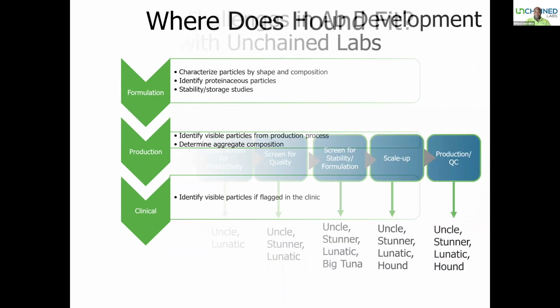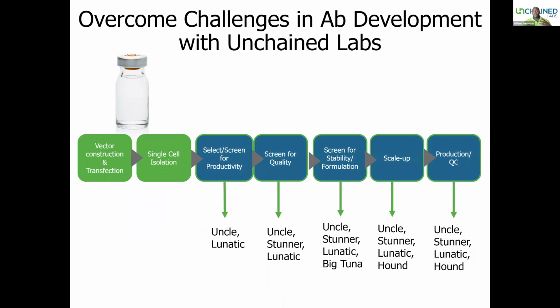So if we now think about what we just went over, which is a pretty sophisticated antibody development process, at every stage things begin to be a bit more interesting, where you have fewer samples, but the value of each sample is actually pretty significant. The further you make your way downstream, the more critical every step is, the more expensive or costly every limitation or stoppage or interruption can be.